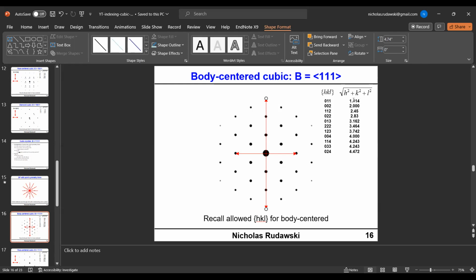So obviously 1.414 divided by 1.414 gives 1. Then 1.414 divided by 2 is less than 1, and the number is going to keep decreasing from 1 and continue to get smaller as we go down the table. Then we look and see if there are any matches with the experimental ratio.